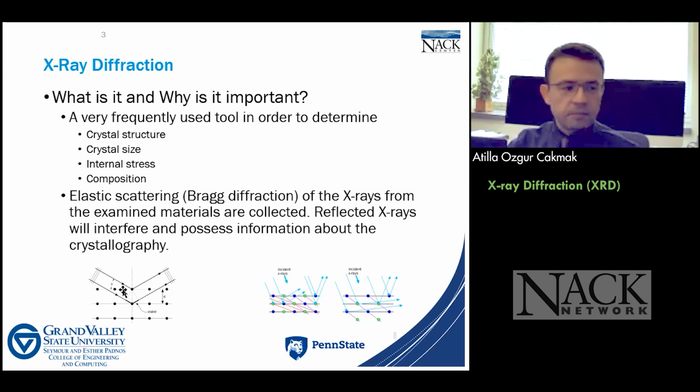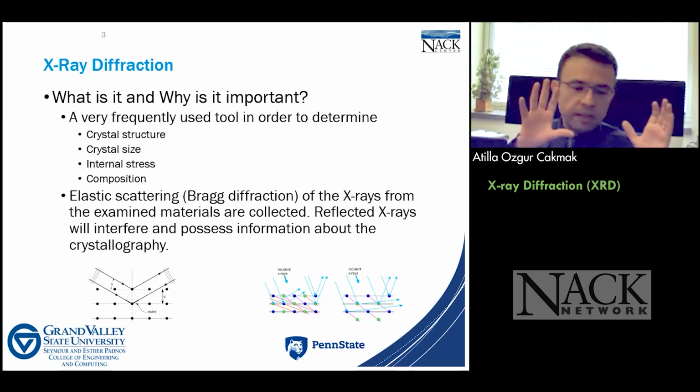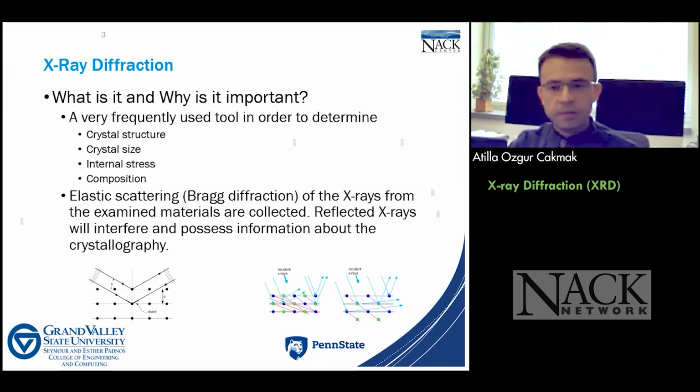So we have our atoms and we can draw that on the board and we can send the X-rays, right? The wavelength is very small. We will talk about that. It's almost like showing a ray phenomenon, as you can see, and then we have these X-rays reflected back in a way. But how are they going to relate to this whole phenomenon for students at all levels, coming from community college or even K-12 up to the graduate level, right?